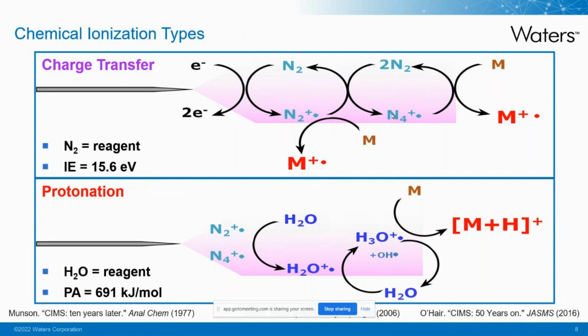In vacuum source GCMS systems, you may spend a huge amount of time trying to get the water out of a system to get it to full dryness, as water can be an indication of leaks. In a vacuum source system, that's a real problem. Here, we're intentionally adding water as a protonating species because the system is otherwise quite dry, right? We have 300 mL per minute of dry nitrogen flowing in, plus 1 to 2 mL a minute of helium. Without this provided supply of water, we would get charge transfer.